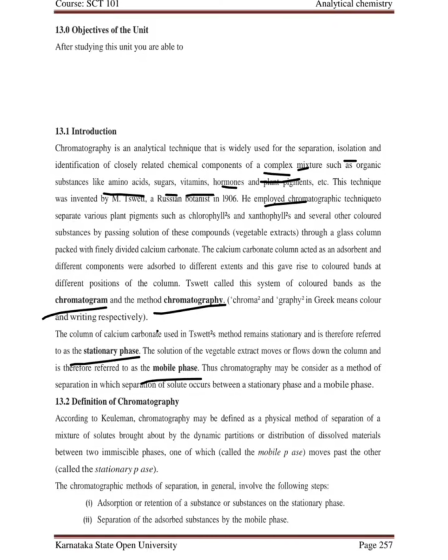Here there are different methods which involve the following steps. The first step is adsorption or retention of the substance on the stationary phase.